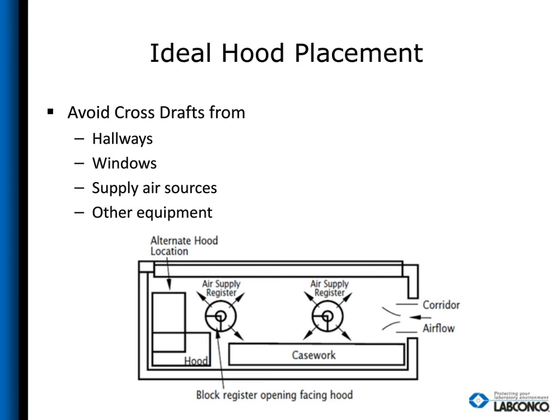Here I want to talk about fume hood placement a little to show the synergy that's created between fume hood performance and placement. This is extremely important because lab conditions are probably the #1 reason that a fume hood doesn't perform the way you expect. In determining the amount of space necessary for the lab, a layout of all lab equipment needs to be made. So locate the fume hood away from high traffic hallways, supply air cross drafts, or any other equipment that could disrupt containment, such as a biosafety cabinet. Also, on a side note, if possible, the hood sidewall should be at least 1 foot away from the room wall to allow access to service connections for future maintenance.